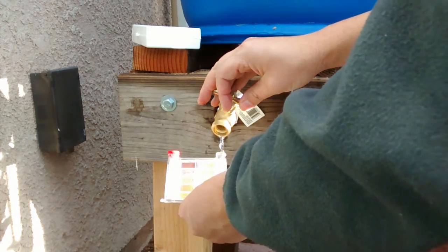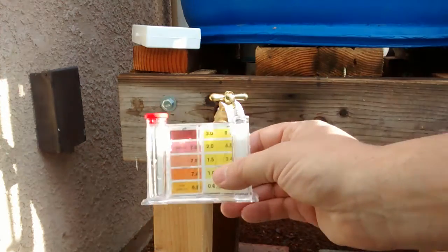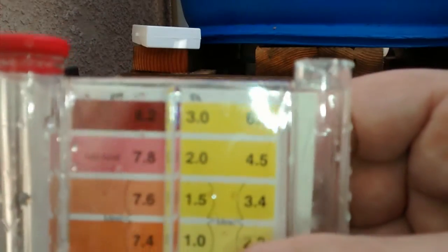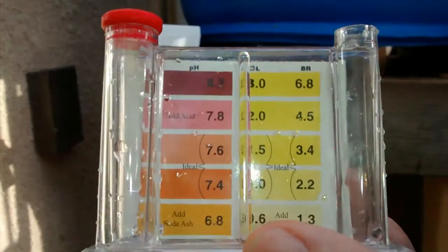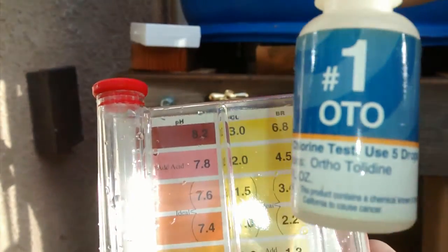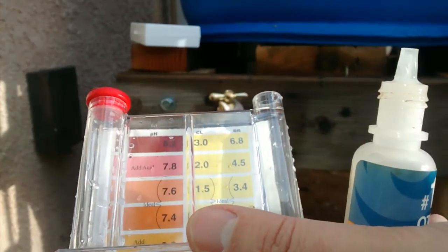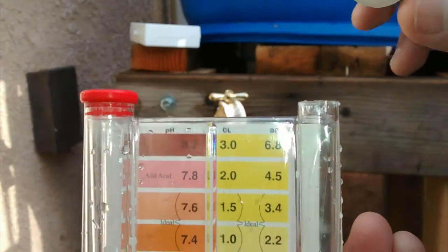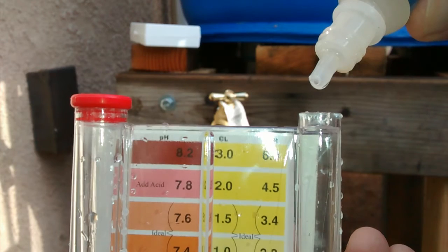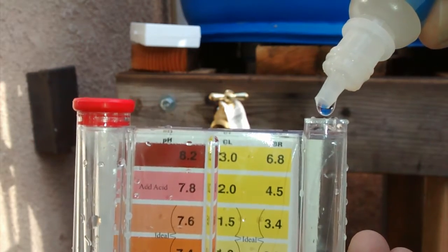Rinse it a couple times. Then, same with this — I've got to take some of the water off the top. That's good enough. Let's go ahead and add the solution. One, two, three, four, five.